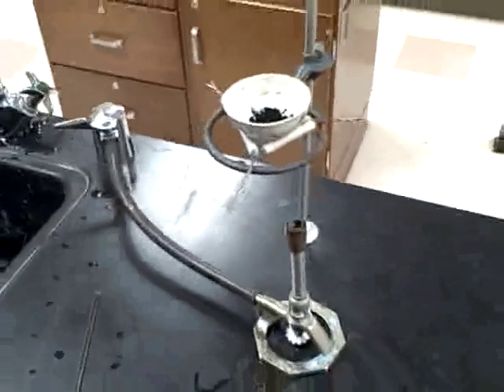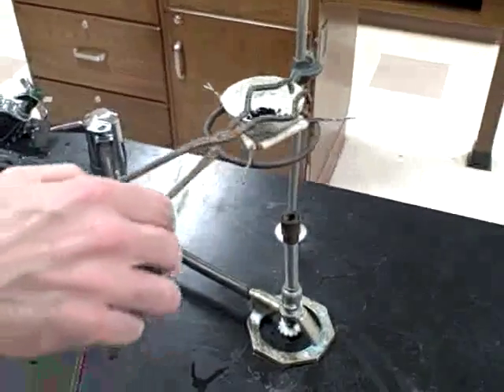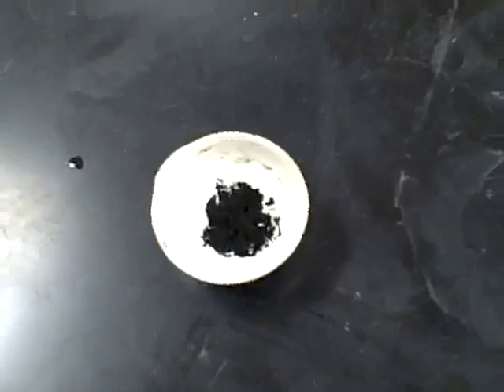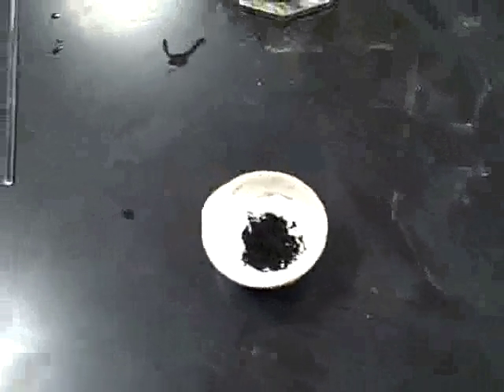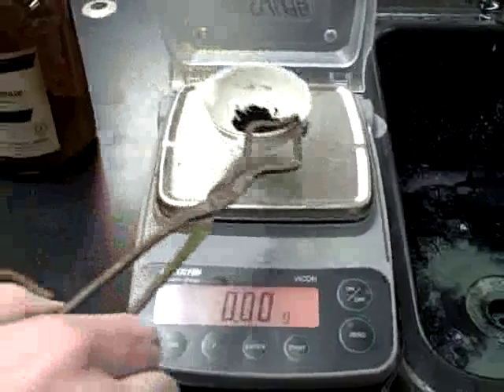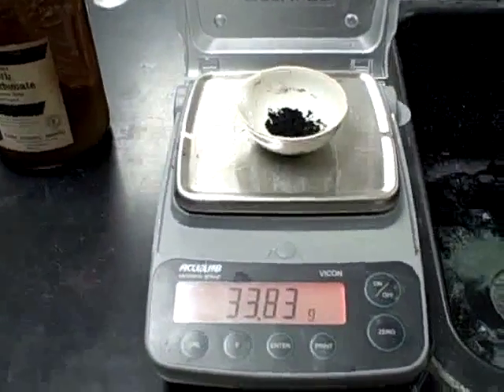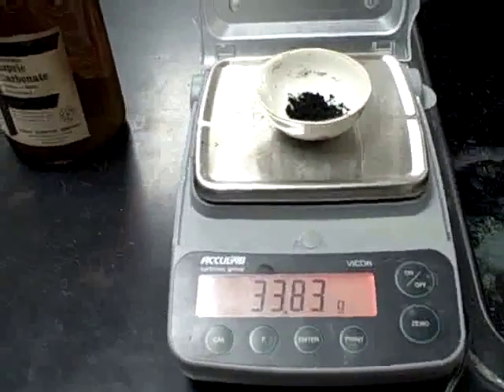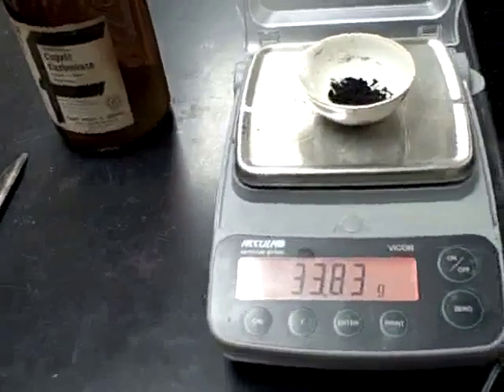Now that we have completed our reaction, we will take the hot evaporating dish and allow it to cool on the lab station for several minutes. After several minutes have passed, we will take the evaporating dish and weigh it on the balance. We will zero the balance, and note that the final mass of the dish with copper(II) oxide powder is 33.83 grams.